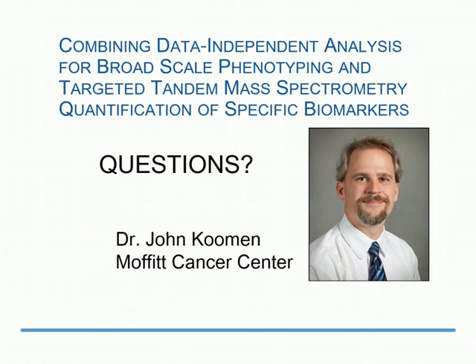All right. Next question is, can DIA be applied to complex protein samples, and second part of the question, also to study post-translational modifications? So first is complex samples and then post-translational. Yeah, so I would definitely say yes, it can be applied to complex protein samples. The reason we're coming up with these hybrid strategies is to make sure that you're able to measure the things that you're really interested in.